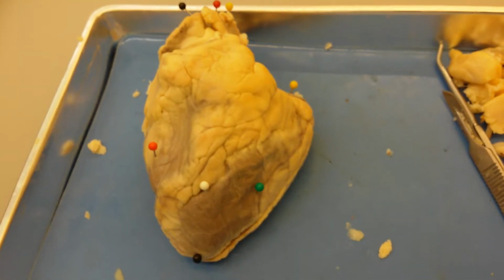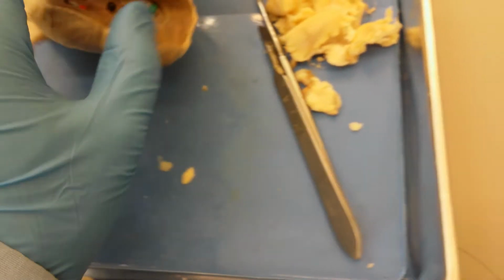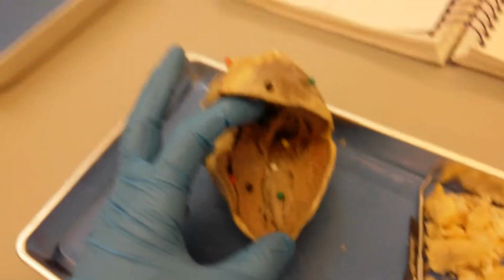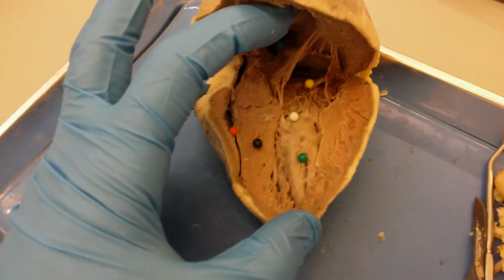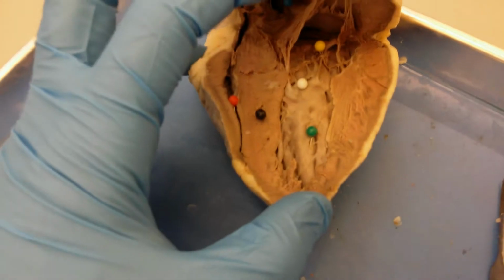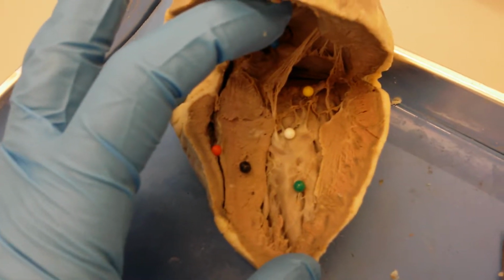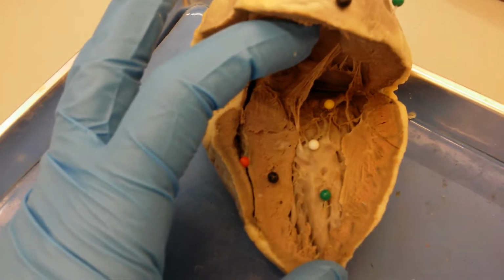Now, if we open the heart like so, this heart has been dissected in a mid-sagittal manner, and I'll try to focus here. So you can see again the green pin representing the left ventricle, and the red pin representing the right ventricle.